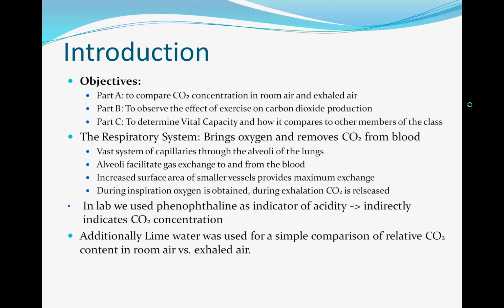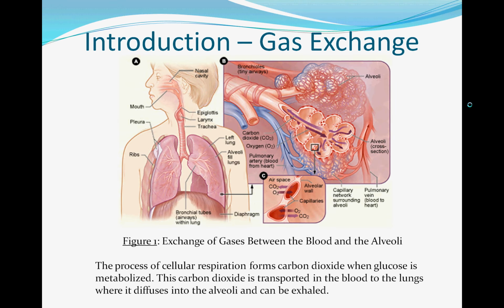In this lab, phenolphthalein was used as the indicator of acidity, and it basically indirectly indicates CO2 concentration. Additionally, in the first part, lime water was used as a simple indicator for CO2 level. So Figure 1 shows the exchange of gases between the blood and the alveoli.